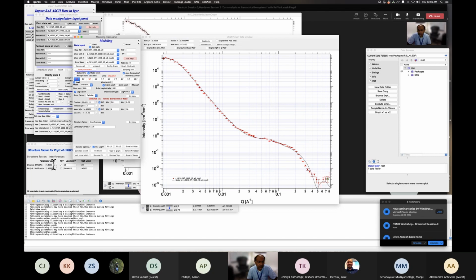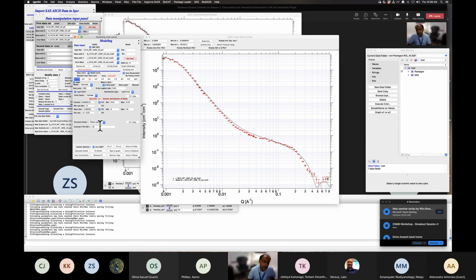So yeah, probably not going to work that way. When you do these hierarchical structural fits, because you use many different models that you combine, there's always the tendency for the fit to diverge in the wrong direction. And we need to always bring them back.